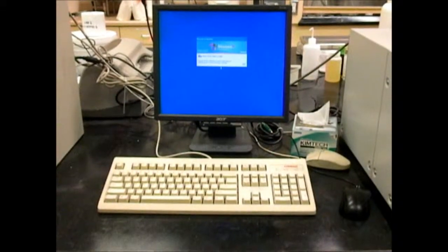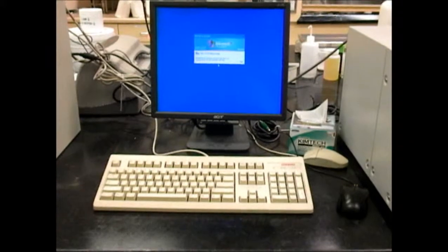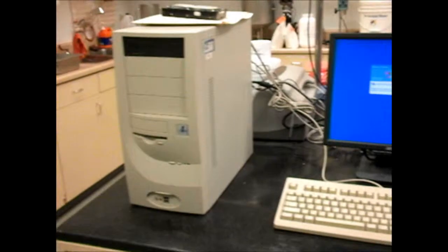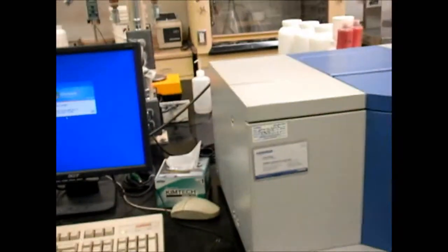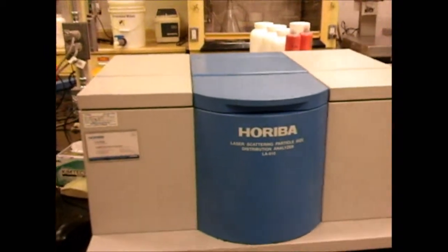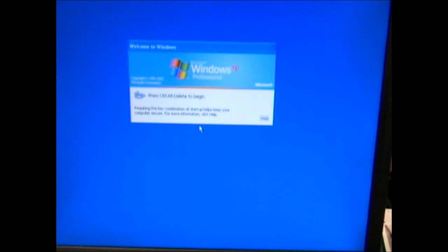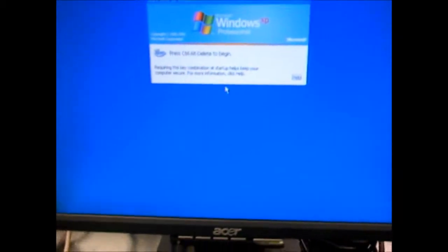This is the Hariba LA-910 setup. We have a computer with a monitor and printer, and a Hariba LA-910 laser scattering particle size analyzer. To start the LA-910, simply flip the switch, then press Control-Alt-Delete. The username is IACHarlab and the password is IAParticle.